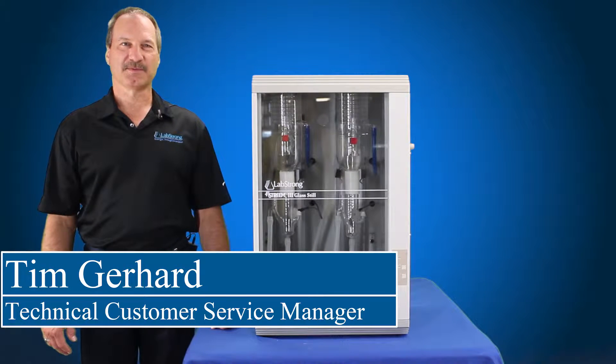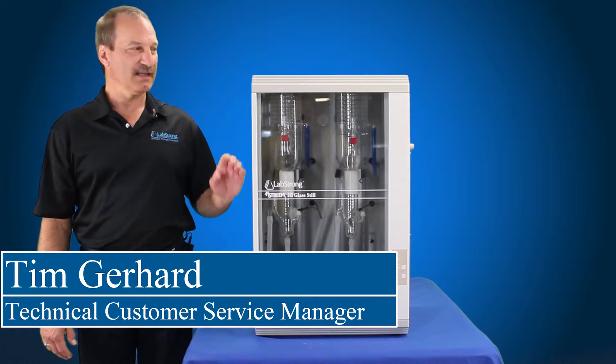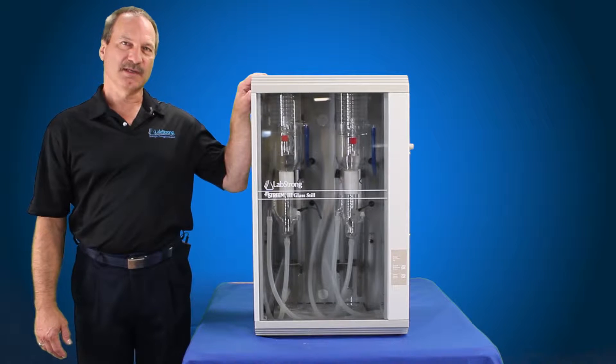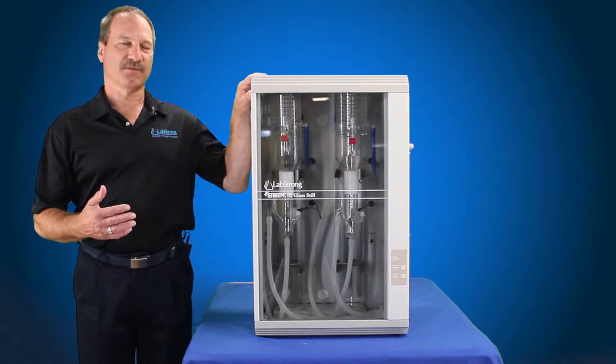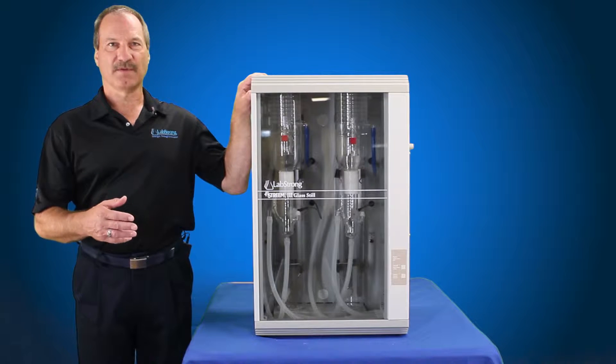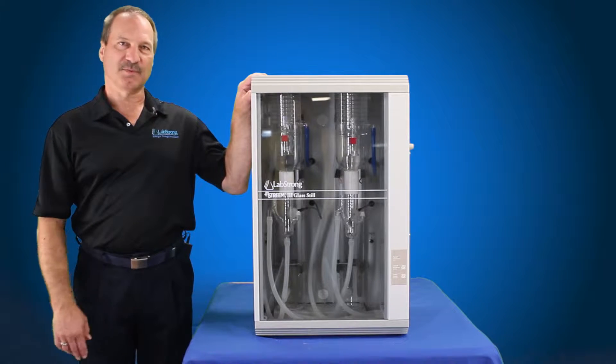Hello, my name is Tim Gehrer. I'm from LabStrong. Today we're going to replace the heating elements on the Fi Streem III. This is an 8-liter per hour system, and it's actually the same procedure for the 4-liter bi-distiller and also the 4-liter. They're all Fi Streem III families, so they'll all be the same to replace.